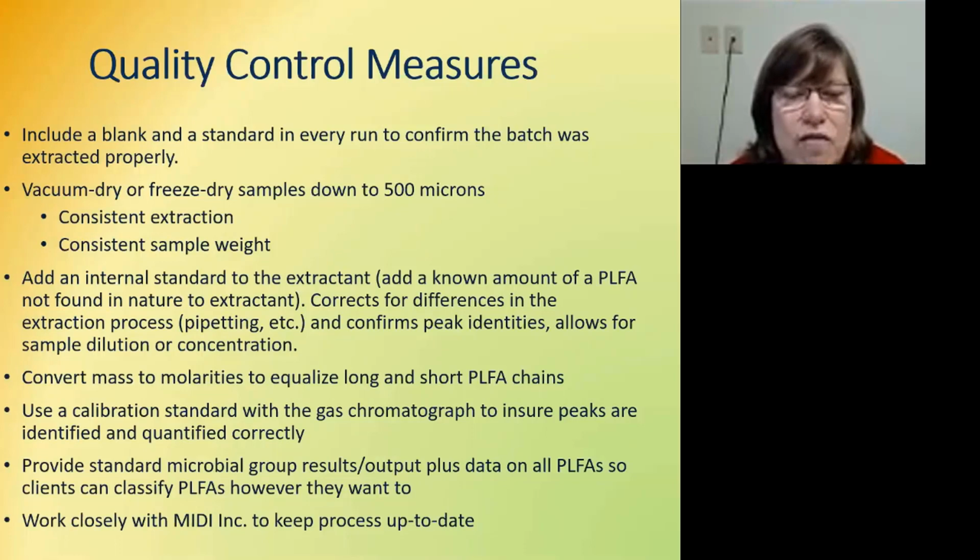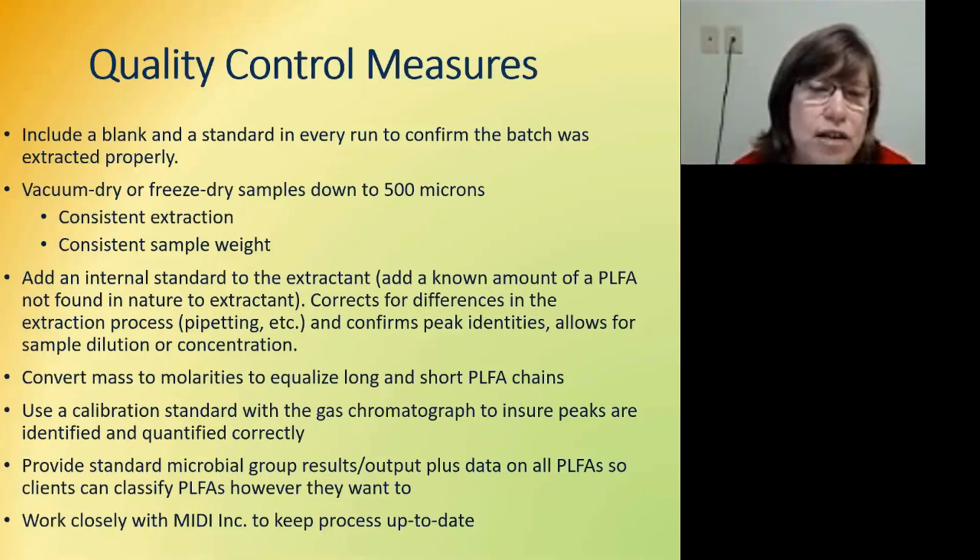Also, if you have more moisture in the soil, you probably affect how well it's extracted, because when you add the extractant, is it diluted by soil water or not? Another thing is we dry down the samples and then we freeze them, so you don't have the 3 degradations that will break down phospholipid fatty acids, which are light, heat, and moisture. So they've been dried down, they're in the freezer, and it's dark. So we can keep them for a relatively long time that way.